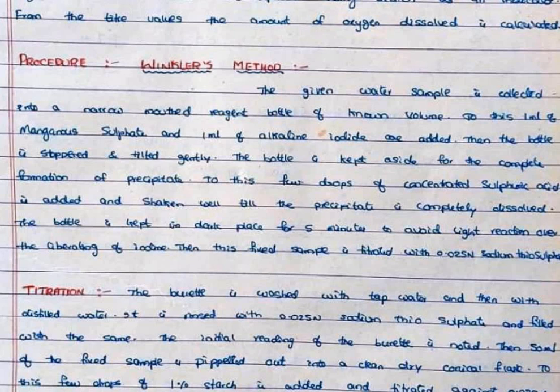Then the bottle is stoppered and tilted gently.